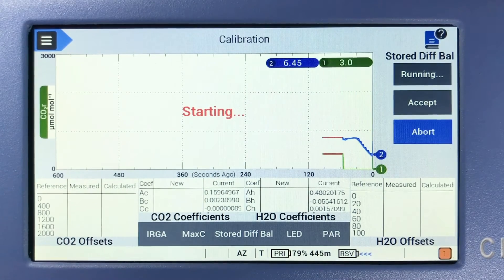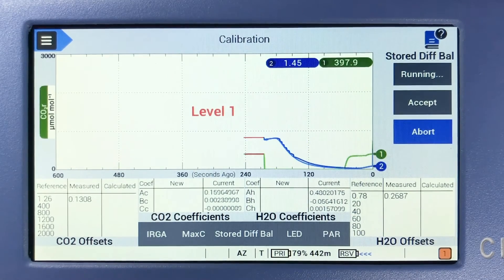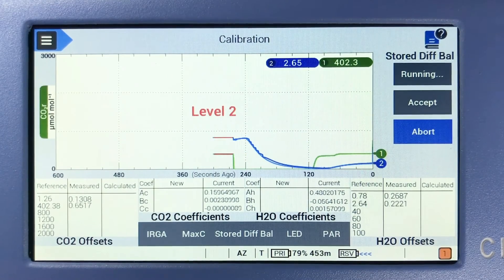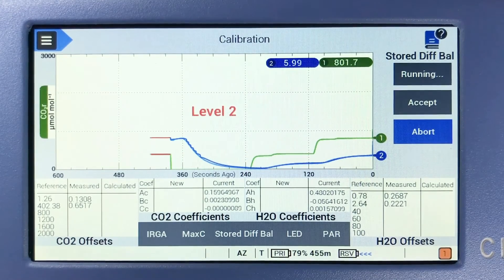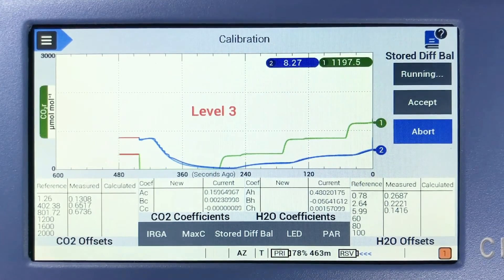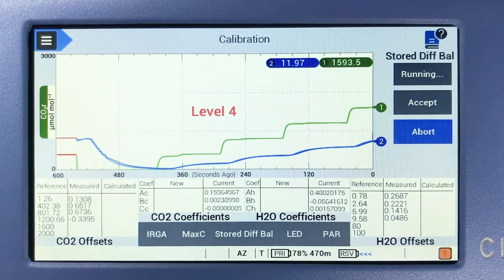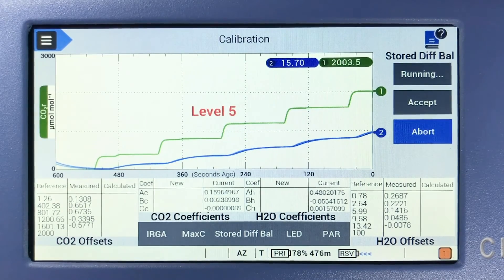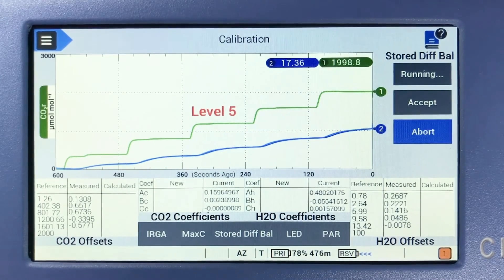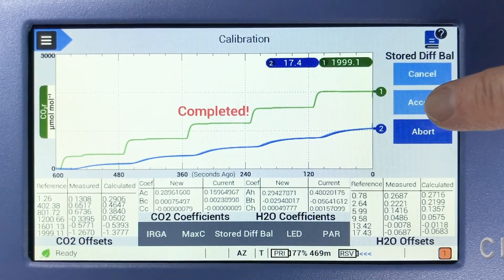Beginning at zero, the CIRIS-4 will step through six CO2 levels between zero and 2,000 micromoles per mole, and six H2O levels between zero and 100% of ambient humidity, performing a DIF-BAL at each level. It then computes a regression analysis of the resulting offsets that will be applied for every CO2 concentration in real time. The stored DIF-BAL calibration takes approximately 12 minutes and must be allowed to continue to completion. Tap the Accept button to complete the process.